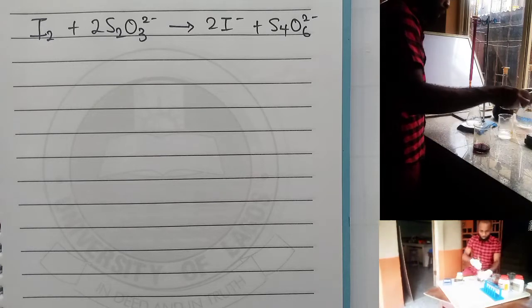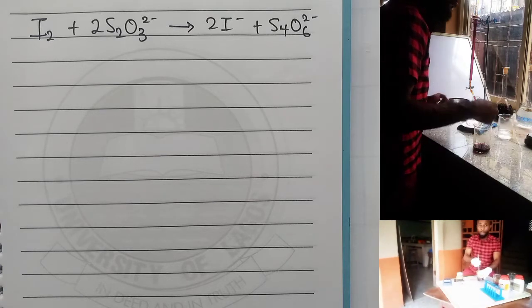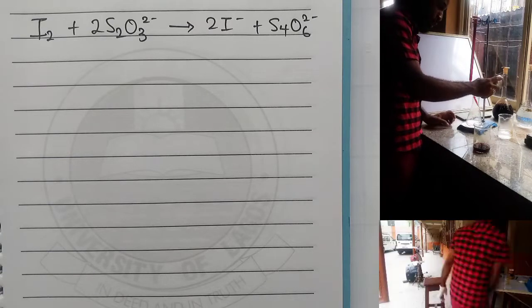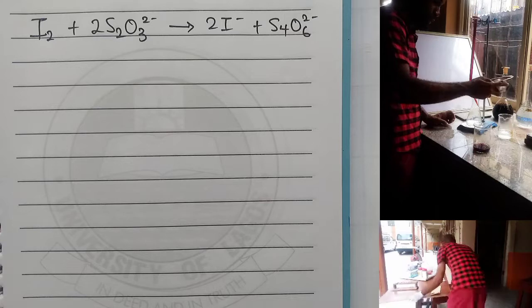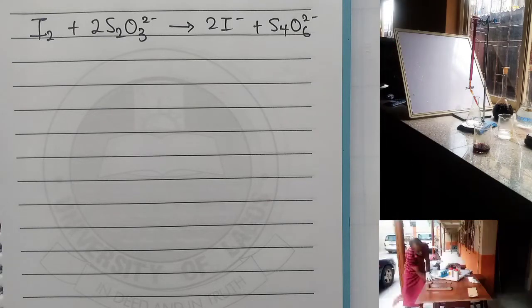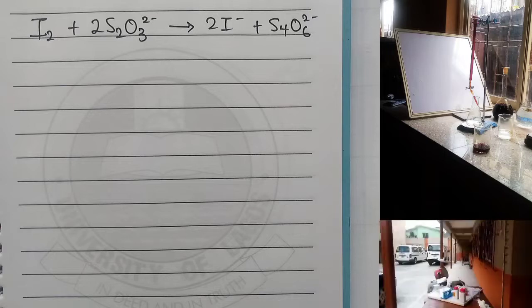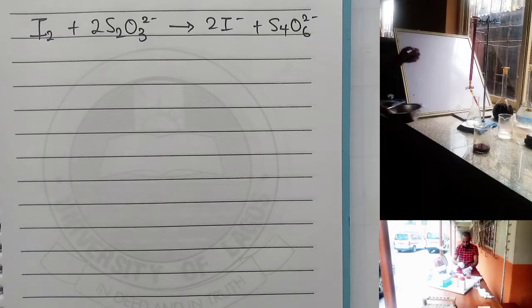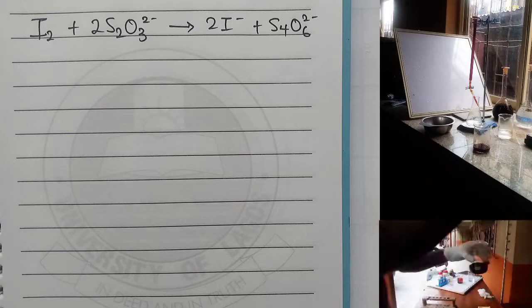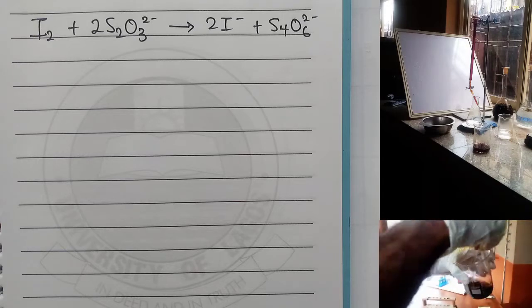And if you check the work I did, as you can see on the screen, I did so many things here. I first of all dissolved some of the iodine inside normal water, just distilled water, to an extent. Then the next thing I went for is I removed the water and started to add the potassium iodide gradually. That is what led me to get what I had.